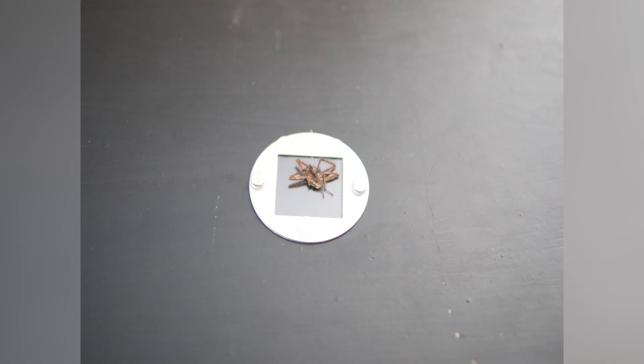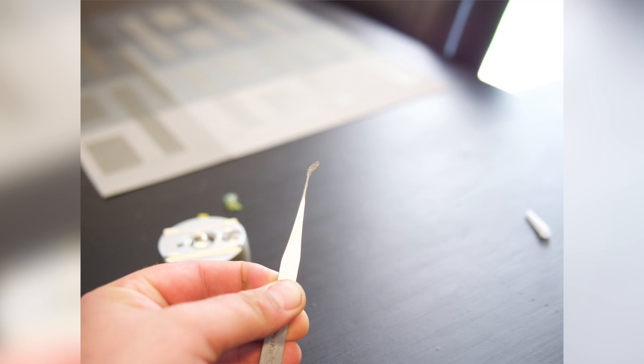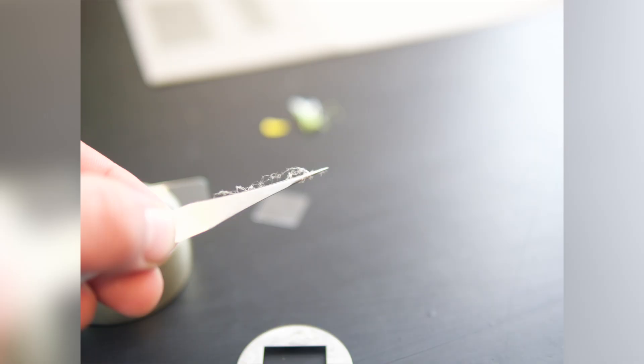This thing is pretty sweet. I went ahead and looked at things like spiders, spider web, and some little creatures — little flies or whatnot. I also tried things like orange juice, drywall, all sorts of stuff. I just went out and started picking around at things and looking at them. It's really neat.